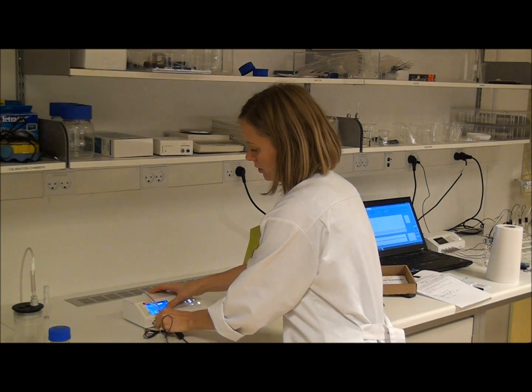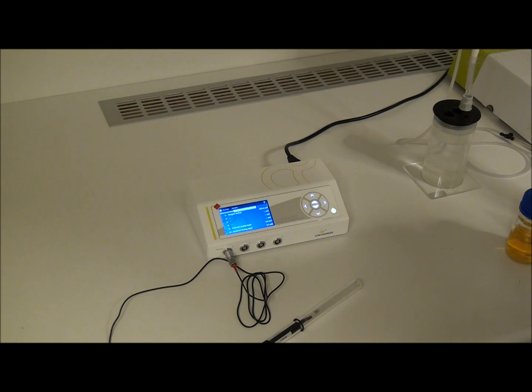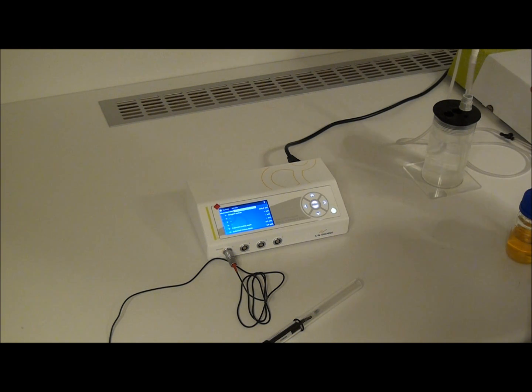Connect the sensor to a Unisense amplifier and allow the sensor to polarize for at least two hours. Monitor the sensor signal on the amplifier or using SensorTrace Basic or SensorTrace Pro.